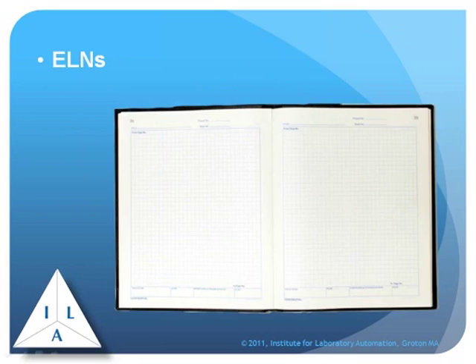Electronic laboratory notebooks are a completely different type of system, dealing with a different type of problem. They're originally designed to mimic the behaviors of a paper notebook. As a matter of fact, there are some people that use Microsoft Word as an electronic laboratory notebook. It can be used for bringing in text, charts, video, audio, almost anything you want to deal with.